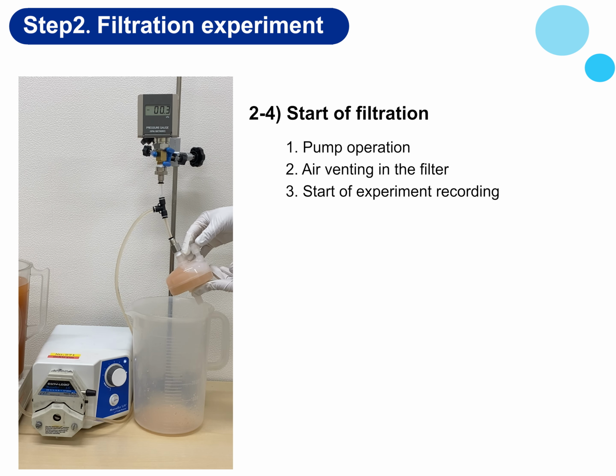The stage at which the air venting operation is completed is the starting point of filtration. And at this timing, a stopwatch is used to start measuring time.